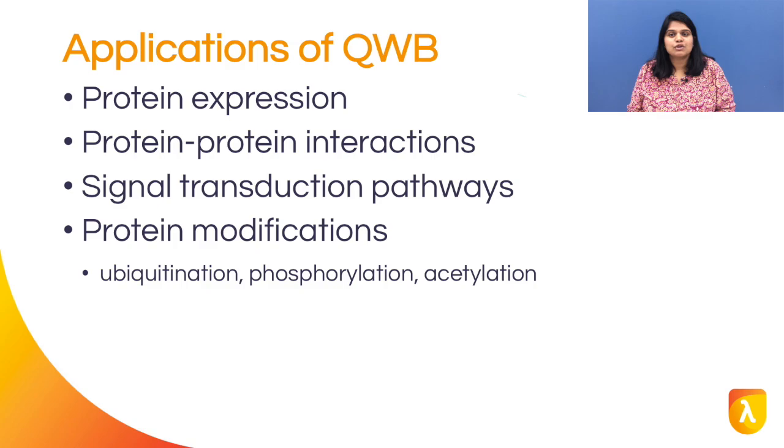Some applications of quantitative Western blots include evaluating protein expression changes under varying experimental conditions, studying protein-protein interactions, comprehensively studying signal transduction pathways, studying changes in protein modifications such as ubiquitination, phosphorylation, acetylation, etc.